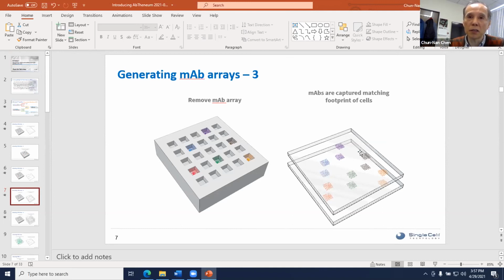Let's say there's a minor difference in the CDR3 that sometimes causes complete loss of the binding activity. So that's the benefit of having the binding profile as well as the sequence at the same time, and you can go back and re-examine what you have done in terms of the binding assay. Great.